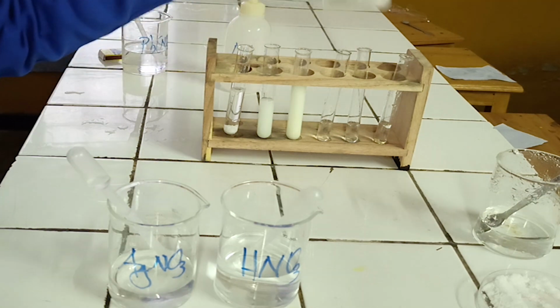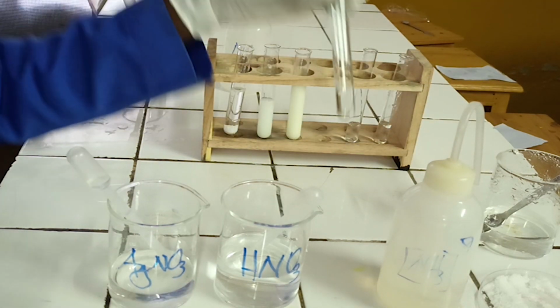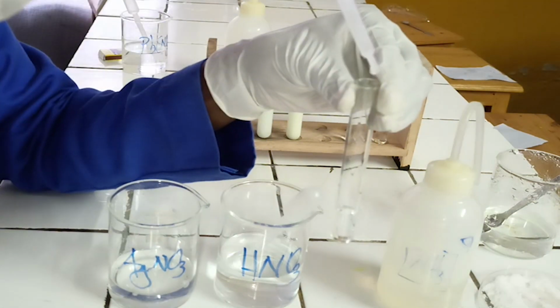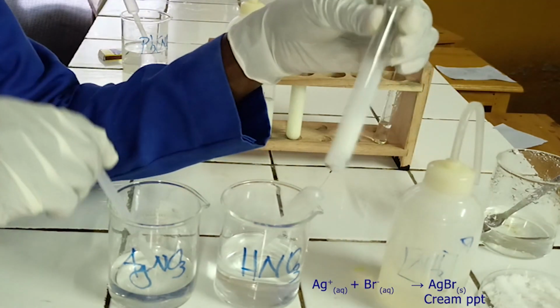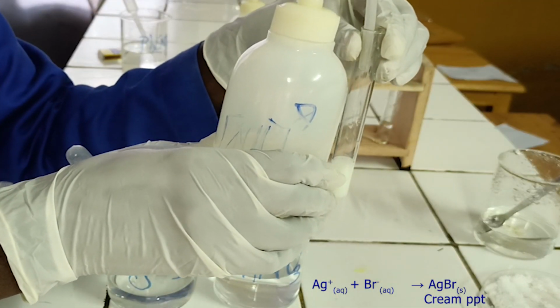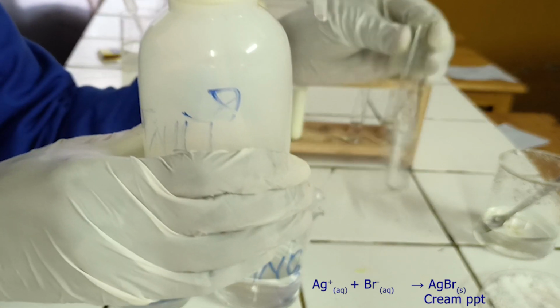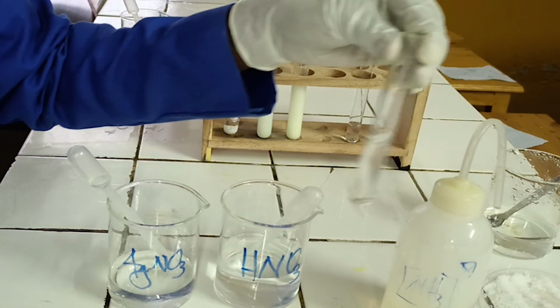Confirmatory test. To the fourth test tube, add silver nitrate solution followed by excess of concentrated ammonia. As you see, silver nitrate solution reacts with bromide ion to form a cream precipitate. The cream precipitate formed is insoluble in diluted ammonia but soluble in concentrated ammonia. Below, there is the ionic equation for this reaction.